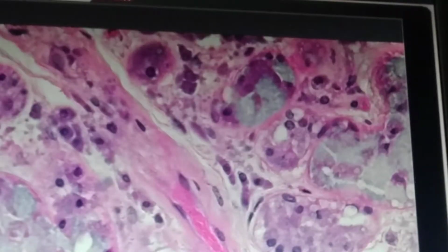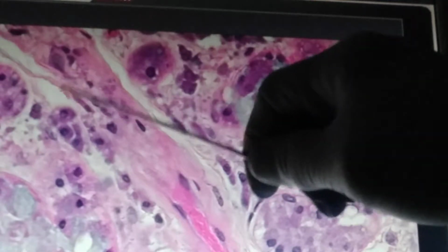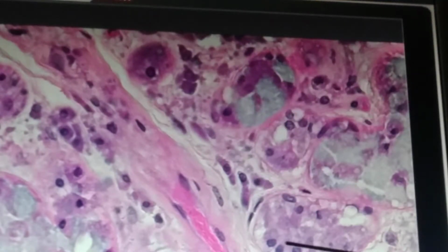Here is another very nice glandular structure, more prominent in the submucosa. These are the mucus-secreting glands of the trachea we just talked about. Look at the gland structure and the lumen of the gland; these are found in the ducts that secrete this substance that lubricates and keeps the trachea moist.